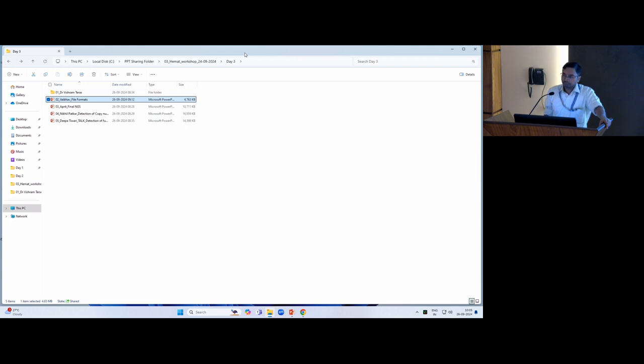Second is that after each step, you should be able to see whether you have achieved what you wanted to. For example, if I wanted to assemble the paired-end reads, the output of that step should be such that you can look at it and say that it has done its job or it has not done its job. So before you actually standardize a pipeline, you have to do this. You have to look at each step and see whether the output is as you expected it to be. Play around with the steps. Not a little, actually you have to play a lot. In the lab, thankfully, the people who came before me have done this, so I need not do it, but once in a while we need to. It takes time. It is a really time-taking endeavor.